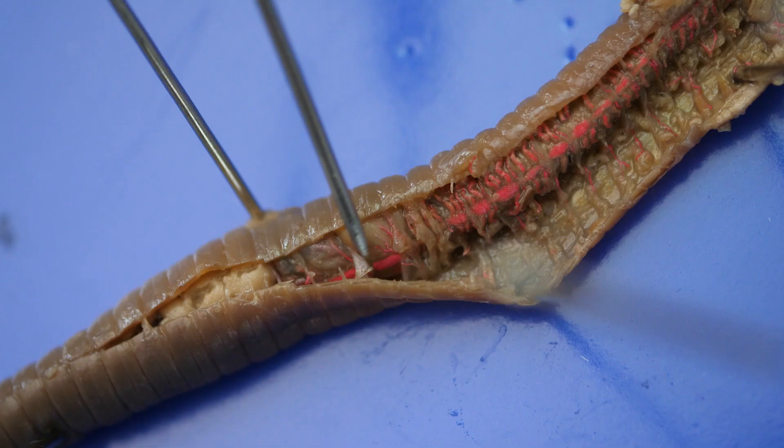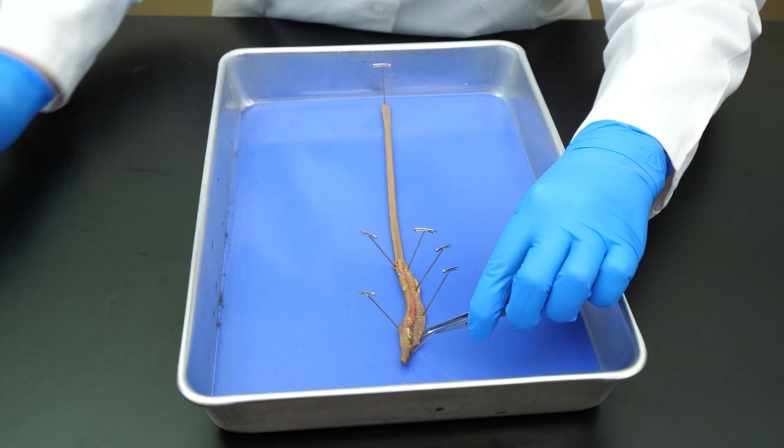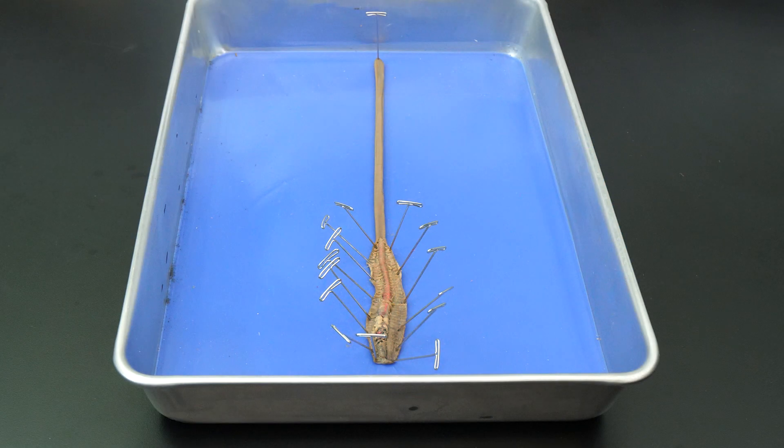Now that we have opened up the coelom, it is easier to see a septum, which is this clear transverse wall of tissue. We repeat the procedure on the opposite side. We do not need to open the worm up any more than this because all the internal organs we intend to examine are located in the anterior region.